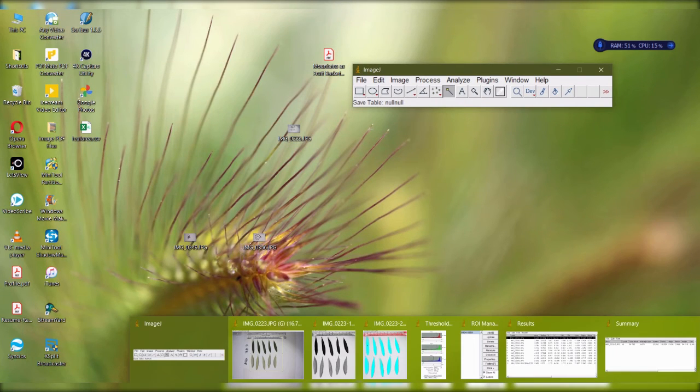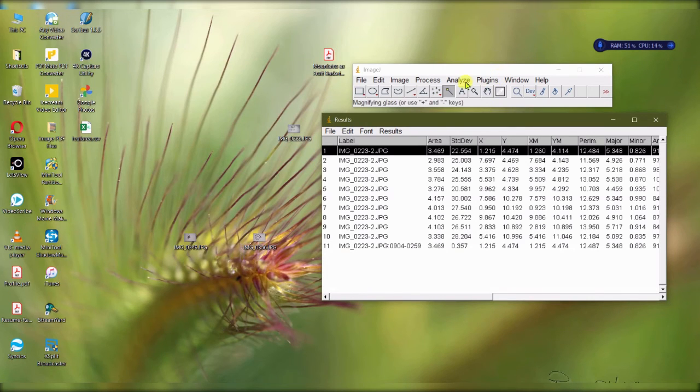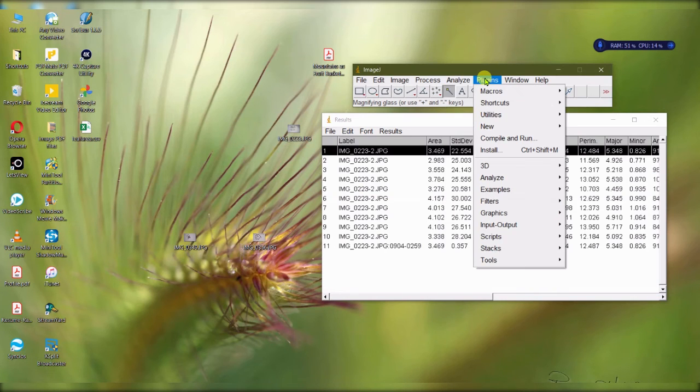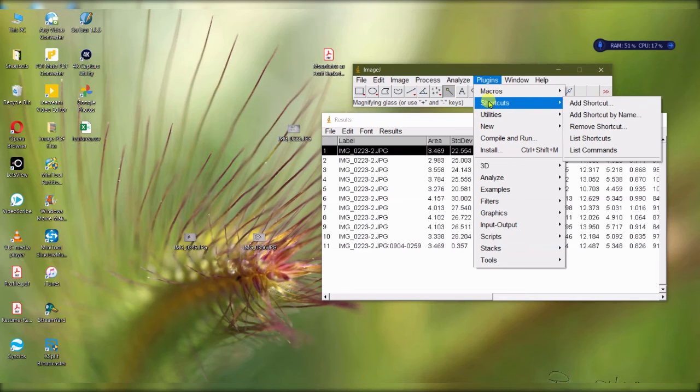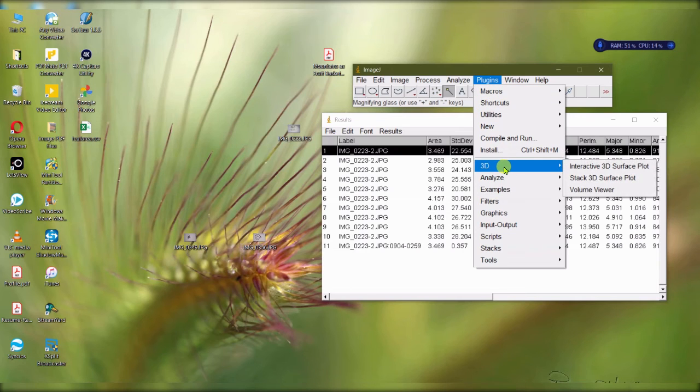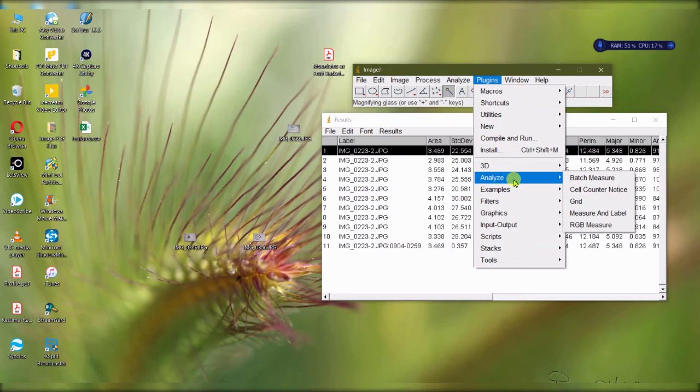It's not just for leaf area - it has a whole bunch of analysis that it can do. It's extremely useful, especially with the macros and the plugins you can have. Anything you want to do here can be done.